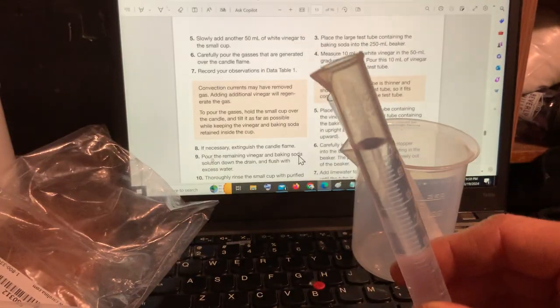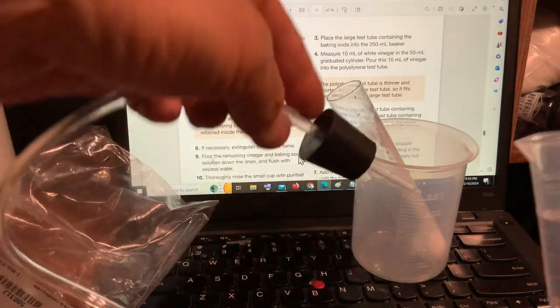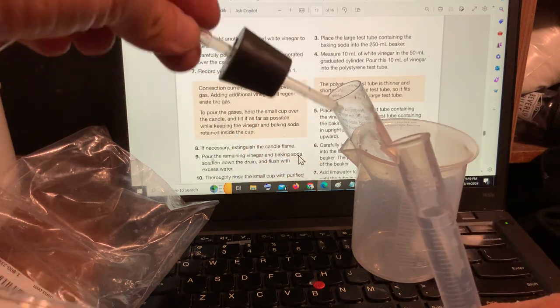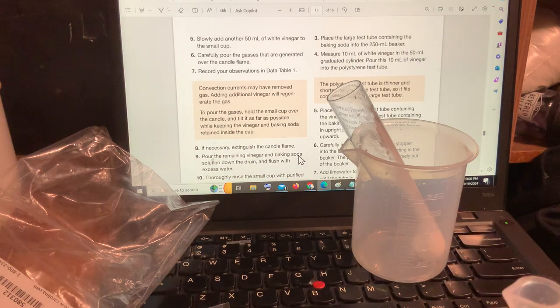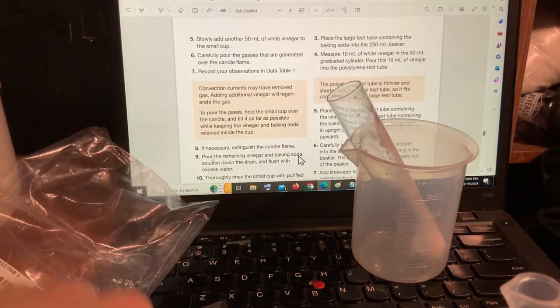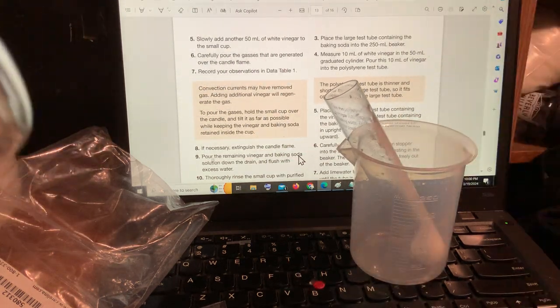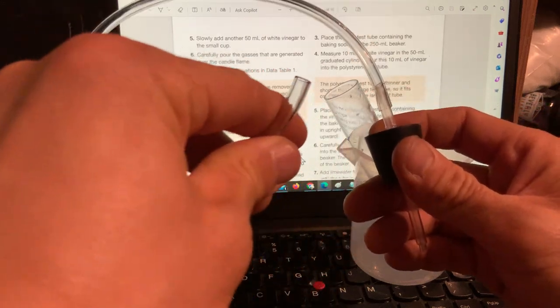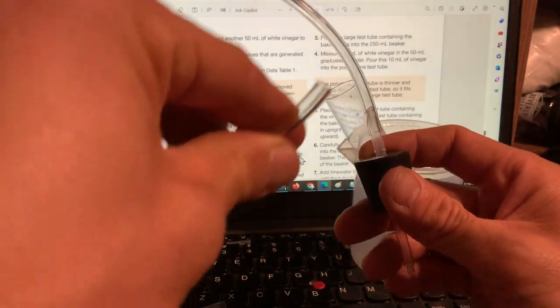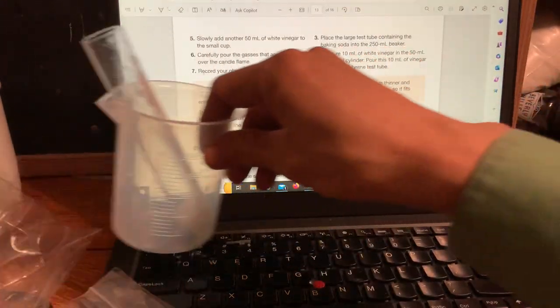Okay, now, before I add the vinegar to the baking soda, I'm going to get this ready so I can put this on as soon as I add the vinegar to the baking soda. However, I'm also going to get the other part ready, because I'm mixing vinegar and baking soda here just to produce carbon dioxide gas. The carbon dioxide gas is going to come up here and go out here, and I'm going to bubble it into some lime water. Put this aside.